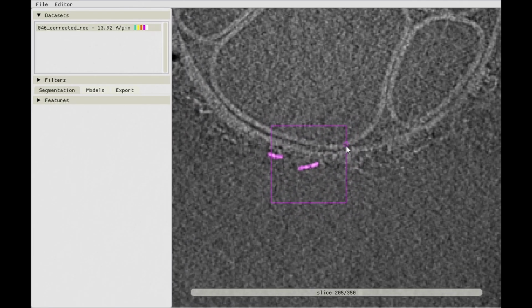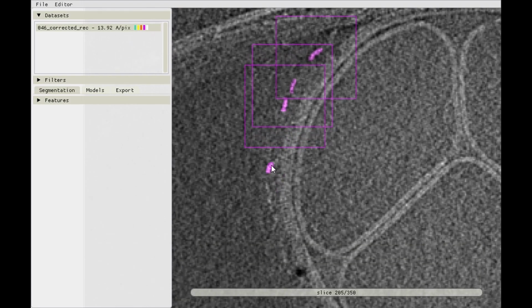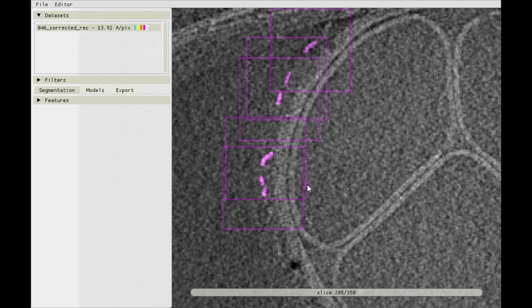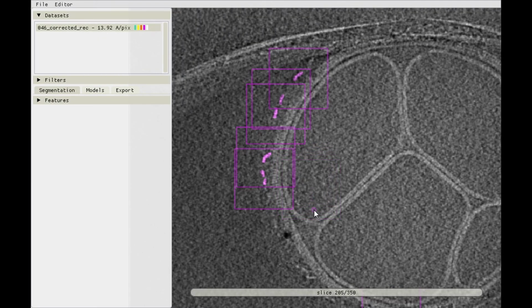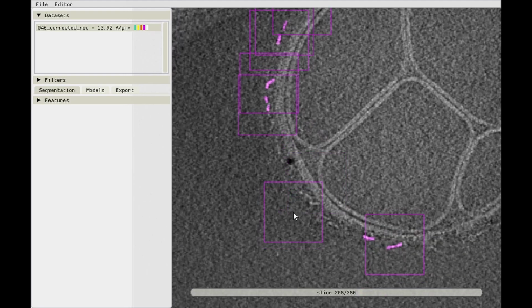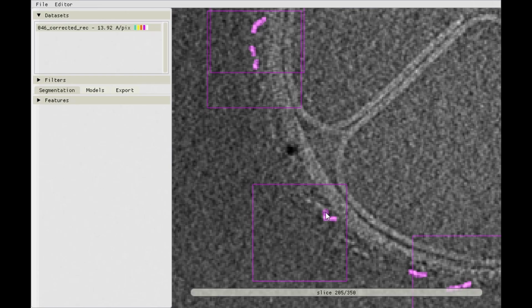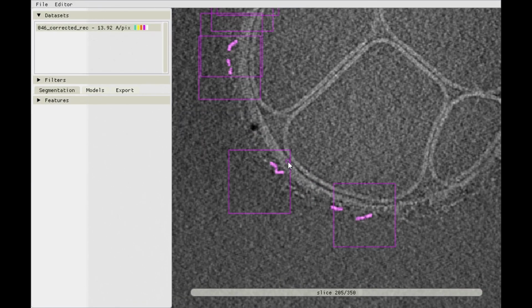A second thing is that if you were to annotate, say, these ones as well, place another box, stuff over here, and this stuff, and then for each one you annotate, you place a box with the feature of interest in the middle, you run the risk of telling the neural network that antibody platforms are always positioned in the middle of a box, in which case it won't be able to, say, pick up this one if a crop like that would end up in the processing step. So what I always also do is pick sort of offside.